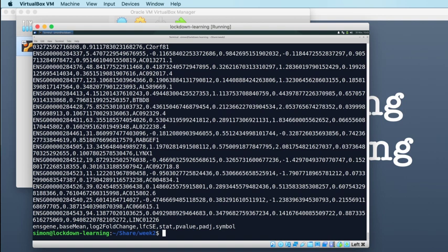So if you look at the output, it's been sorted based on the beginning of the line. Effectively what this has done is move the header of the file down to the bottom, because lowercase e sorts after uppercase E. All of the other lines which begin with an Ensembl gene ID begin with ENSG in uppercase, whereas this starts with ENSG in lowercase, and lowercase sorts after uppercase.